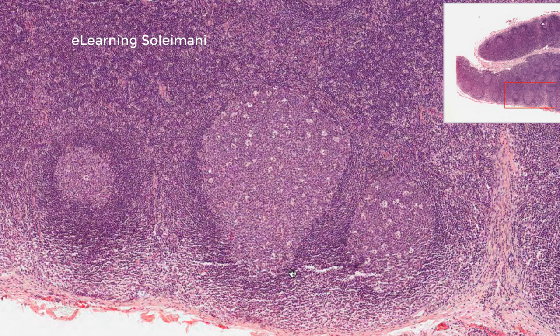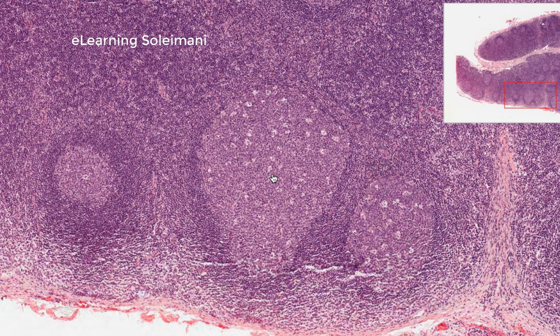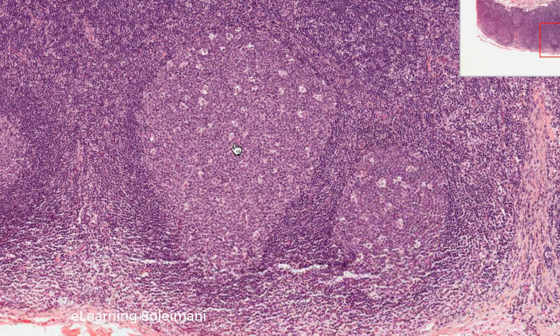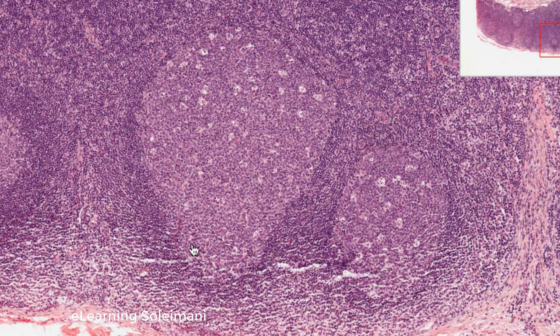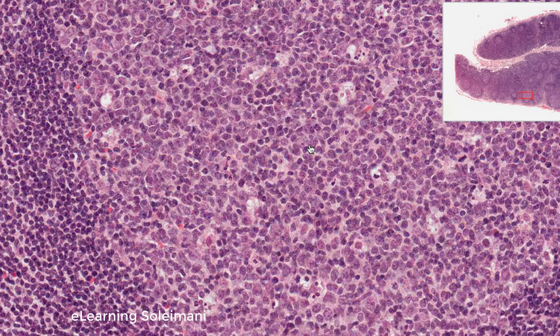The follicles with a germinal center are called secondary follicles, as the follicles without a bright center are named primary follicles. The bright center is because of the larger cells with clear nuclei.